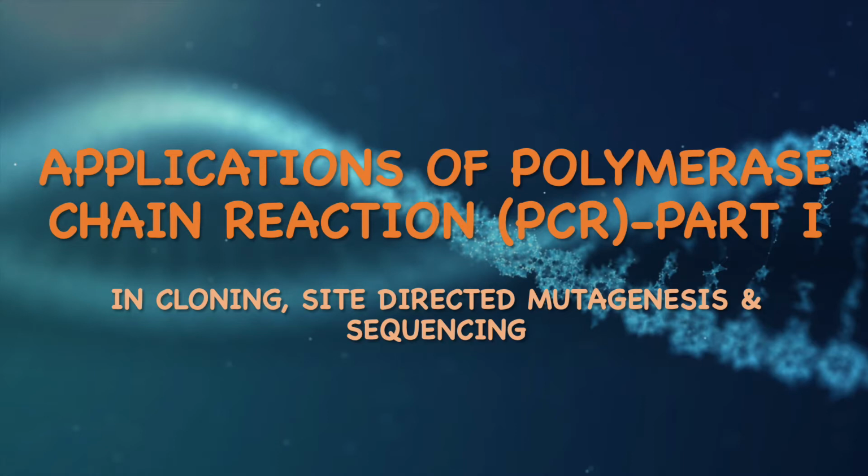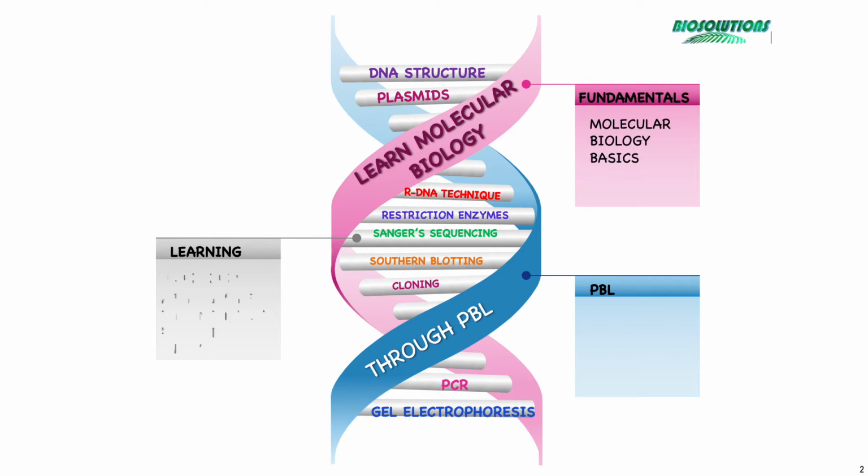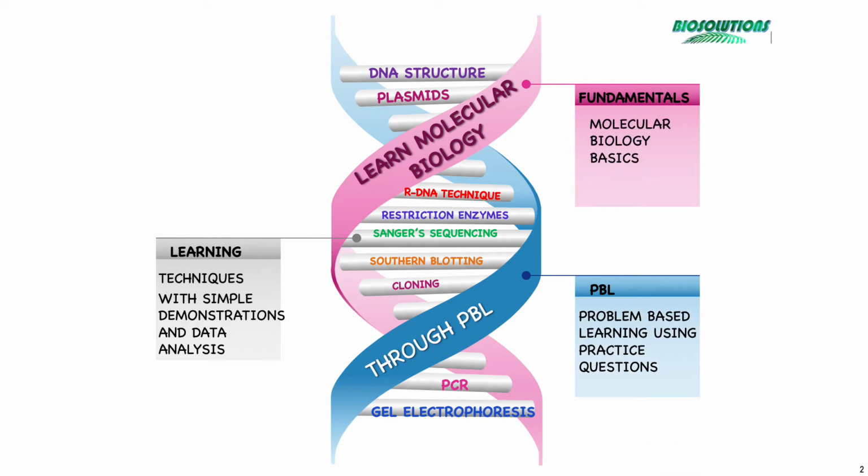Hi friends, welcome again to this tutorial where we will learn in which fields PCR can be used. PCR technique has widespread applications in the field of medicine, research, forensics, agriculture, and many more. Let's learn more about them.